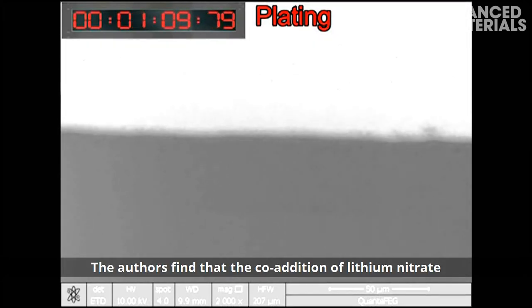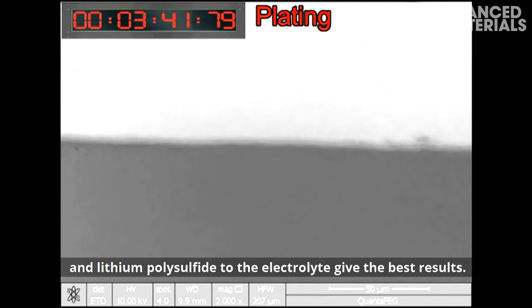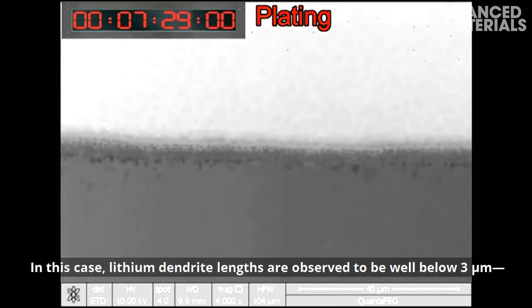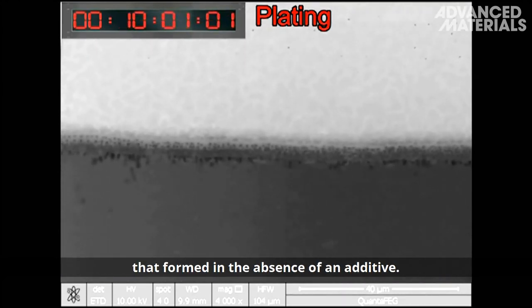The authors find that the co-addition of lithium nitrate and lithium polysulfide to the electrolyte gives the best results. In this case, lithium dendrite lengths are observed to be well below 3 micrometers, significantly shorter than the dendrites that formed in the absence of an additive.